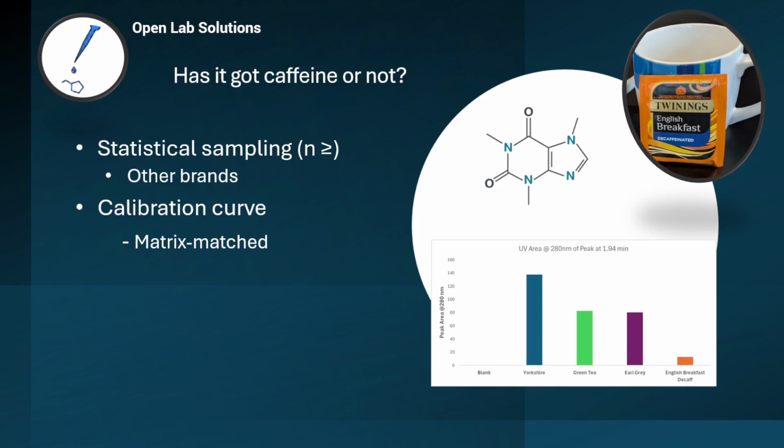And we have to make sure that we don't fall into this trap of getting the influence of these other molecules on our quantitation. Of course, if you want to make this even more accurate, you can get hold of a standard, the caffeine standard, which is then isotopically labeled, the heavy labeled version of it, so where we've got either the carbons or the nitrogens labeled, and we can then also fortify that into the samples and look at the recovery of that, and that would also improve the mass spec type of analysis.